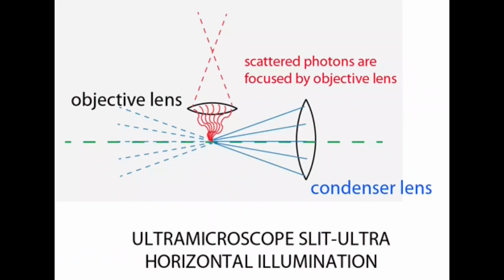Some of you may be familiar with the ultramicroscope invented by Siedentopf and Zsigmondy in 1903. It uses a very low NA horizontal illumination to give dark field images. It was used for highly diluted colloids of gold particles in water or sometimes in glass. It detects particles but does not properly resolve their detail. For submicroscopic particles, an Airy disk or point spread function is observed. The particles must be diluted enough to stand alone in the field.